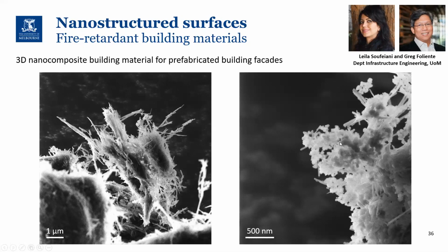And here we are again using the resolution and the surface sensitivity of the helium ion microscope to get these images. This was proving a challenge for the researchers to do with SEM because they needed the coating, but the coating was not coating very well onto these fibers, so they were still getting lots of charging. And TEM gives them stunning images, but TEM was requiring quite a lot of sample prep. So the helium ion was a nice balance between the SEM and the TEM, giving them the resolution that they needed with minimal preparation of their samples.